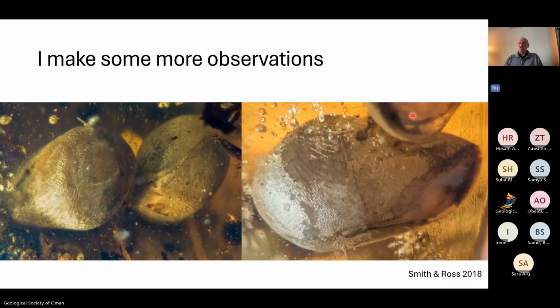And another observation, a third observation, some of those structures have got bivalves preserved inside of them. And these are very distinctive boring bivalves that land on a rock, or in this case, a hardened piece of resin. And then they bore in and live inside what's called a crypt. And in that picture on the right, if you look at the lower left side, you can see there's lots of whites there. And you can see there's lots of very fine structures. Those are the ratcheting marks that bivalve makes when it's excavating its crypt, its boring. So 3 observations, that's quite good. And they're no longer fungal sporocarps, are they? Next slide.